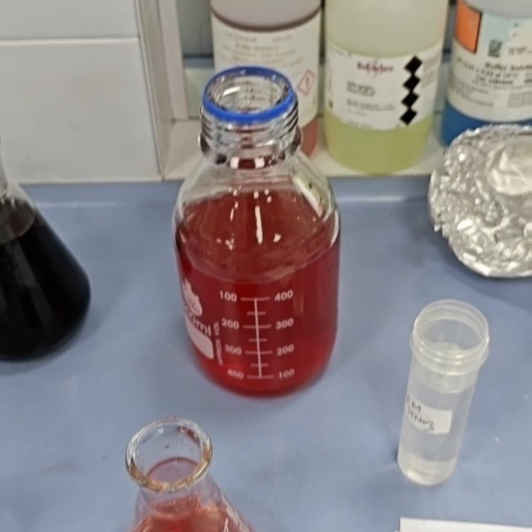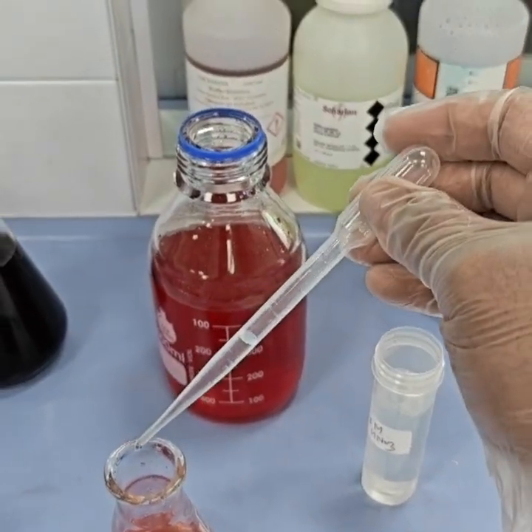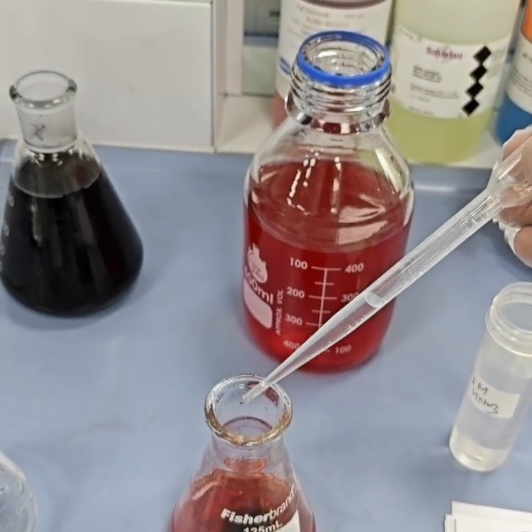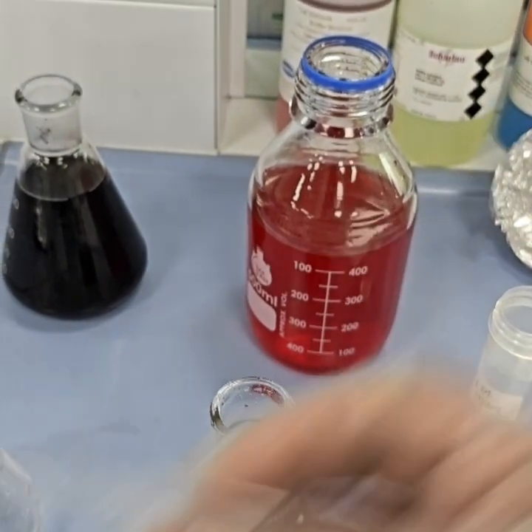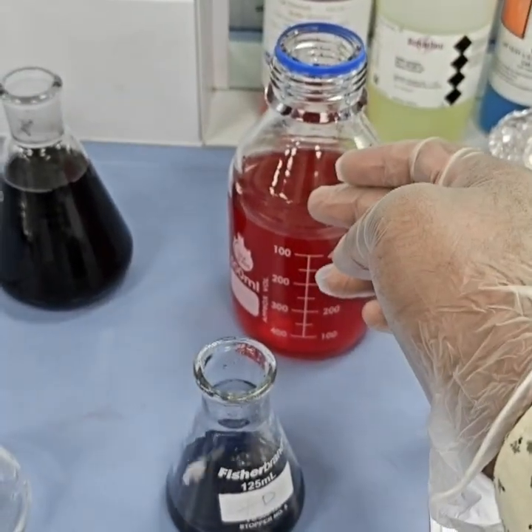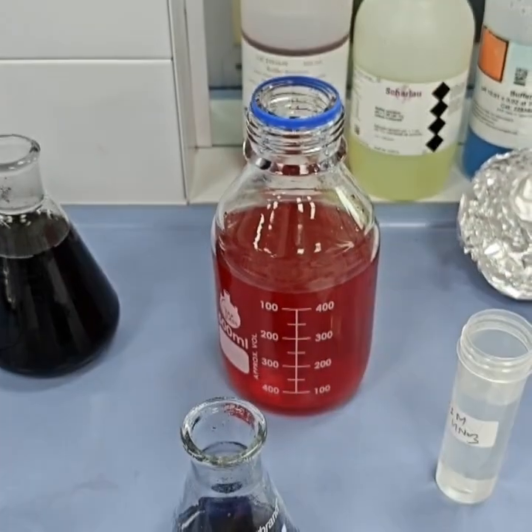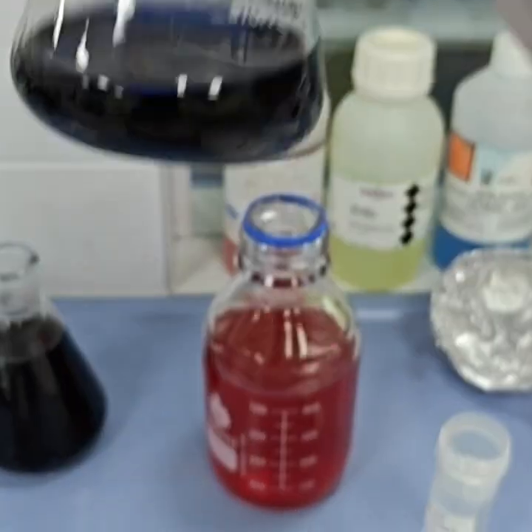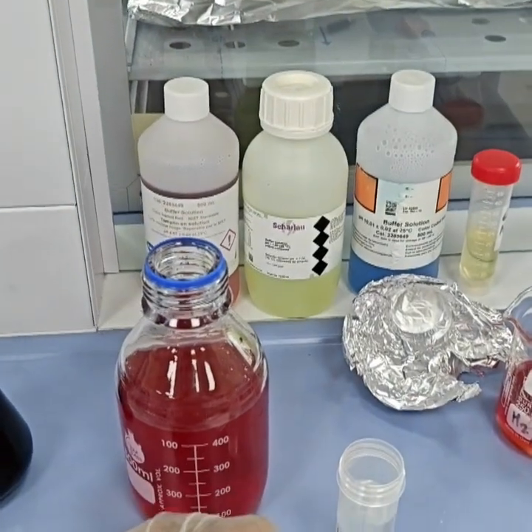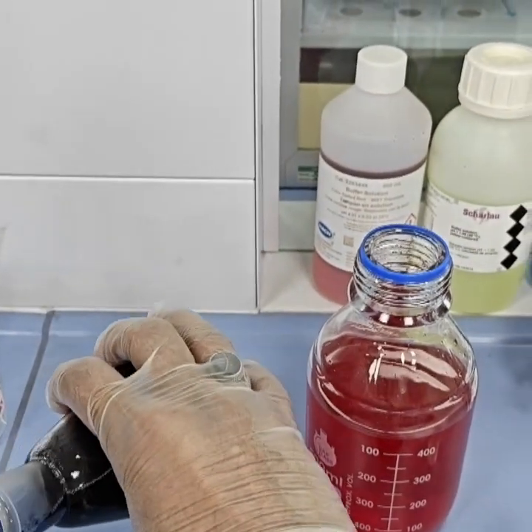For example, this is my Congo red dye, and this is nitric acid. I'm trying to add acid. You will see the color start to change. Let me keep adding. The color changed from red to blue. It would be hard for UV or other devices to quantify, since the color changes and it also starts to precipitate. Now let us add the EBT.